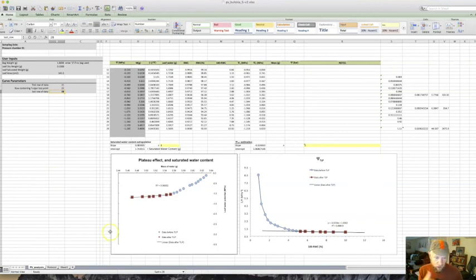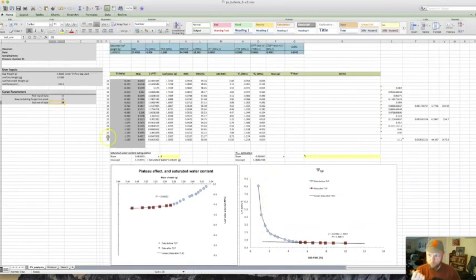And so I'm going to leave it right there as 22. My R squared is 0.89, so it's a bit lower than I typically have, but I'm feeling pretty confident that we've hit that linear portion. And so then all of the blue symbols are in this nonlinear portion of the line. The other things to look for here is there's two things, and I'll try to find a curve that doesn't look as neat as these here in a minute.